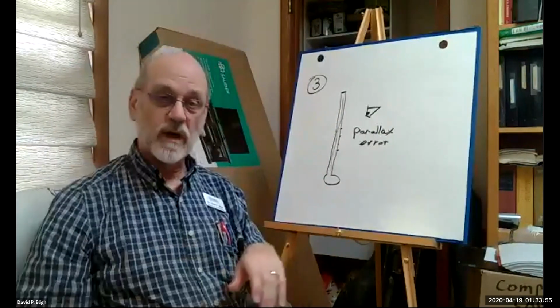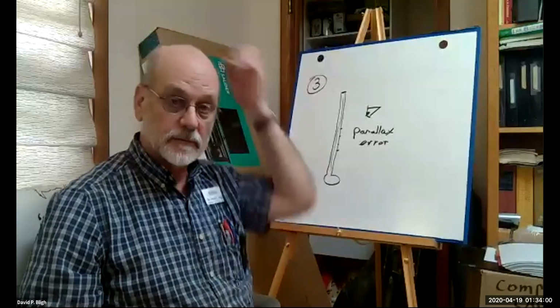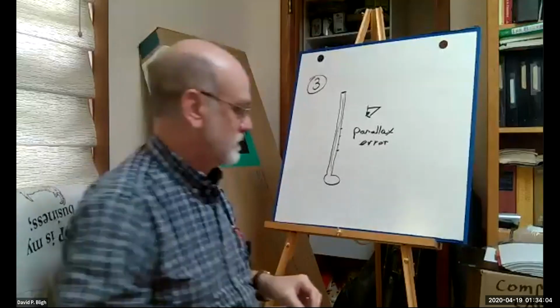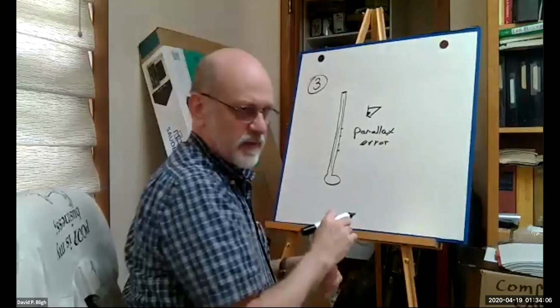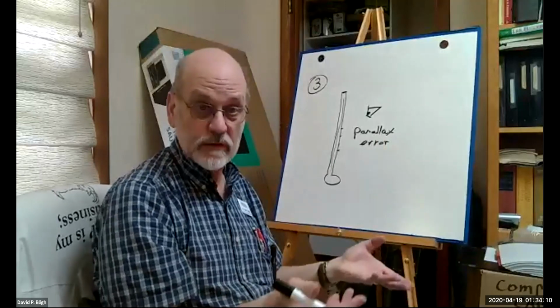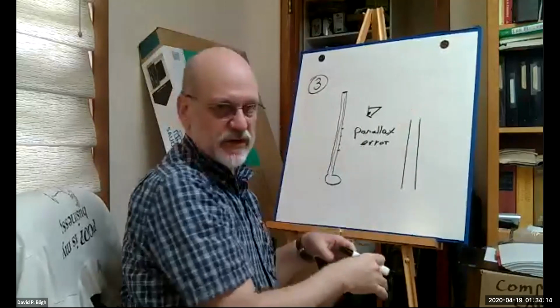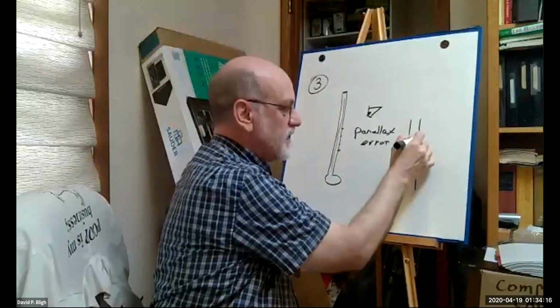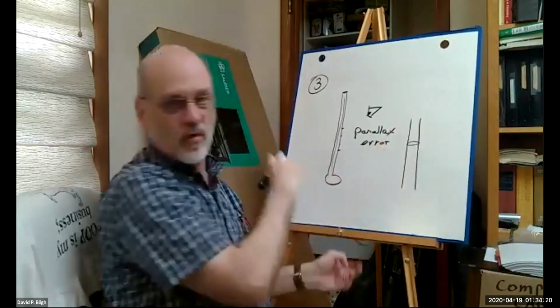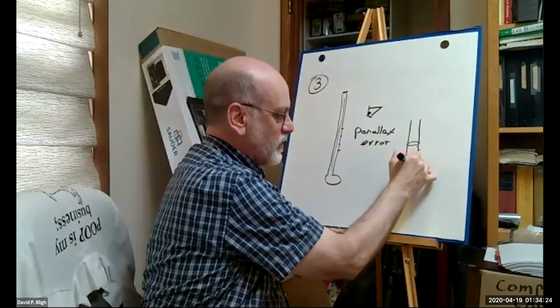And some glassware is designed to help you accomplish that. Right? Volume measurements in graduated cylinders or burettes or pipettes, this could be any tube of glass, periodically they have markings that go completely around. You have markings in between, and then you'll have completely around.